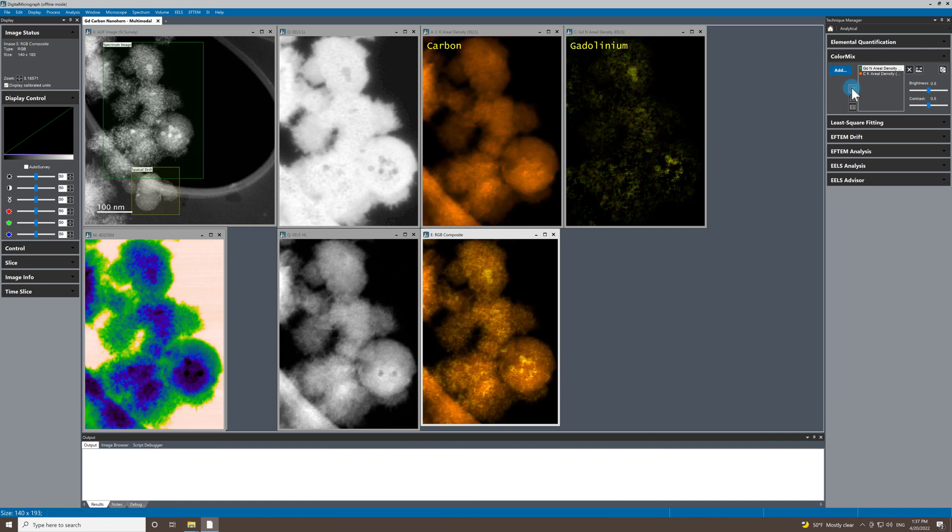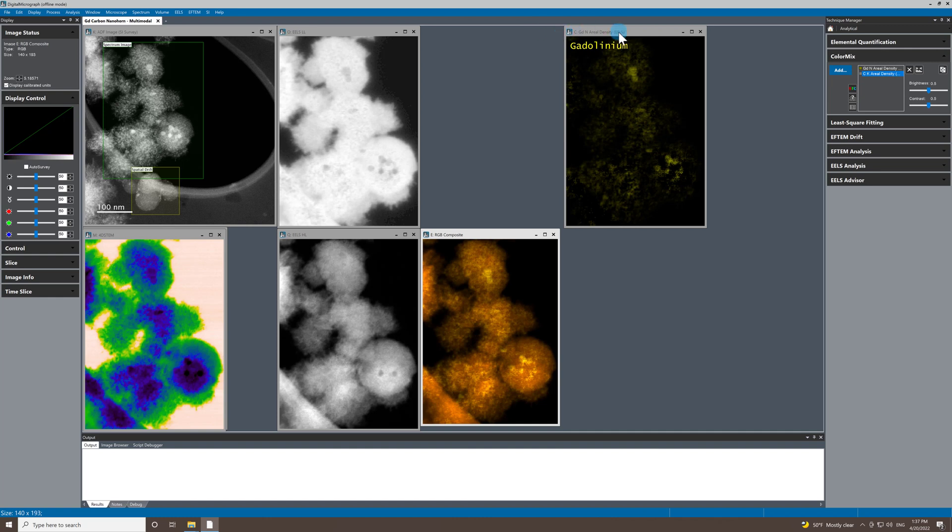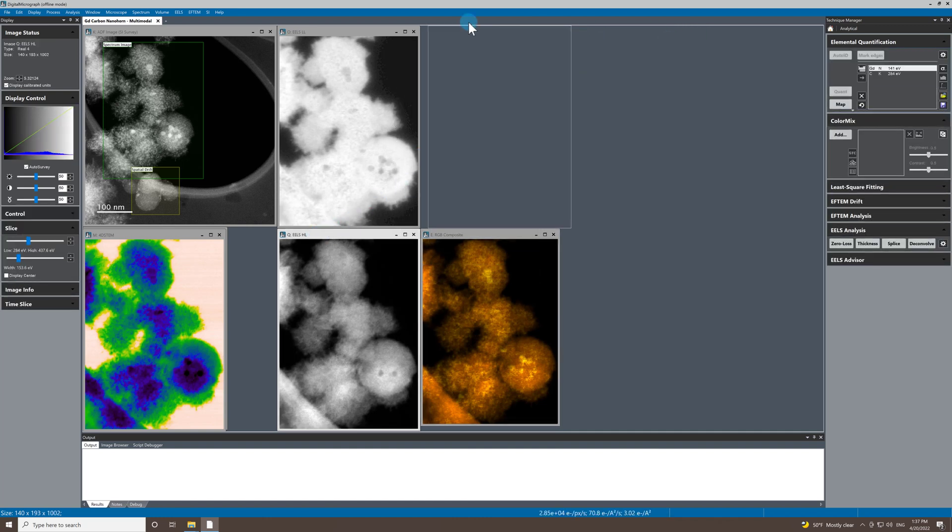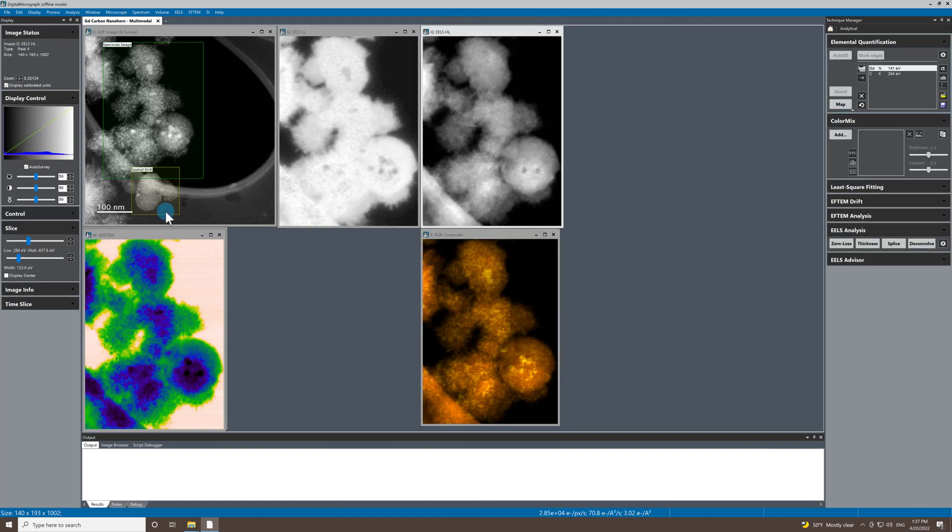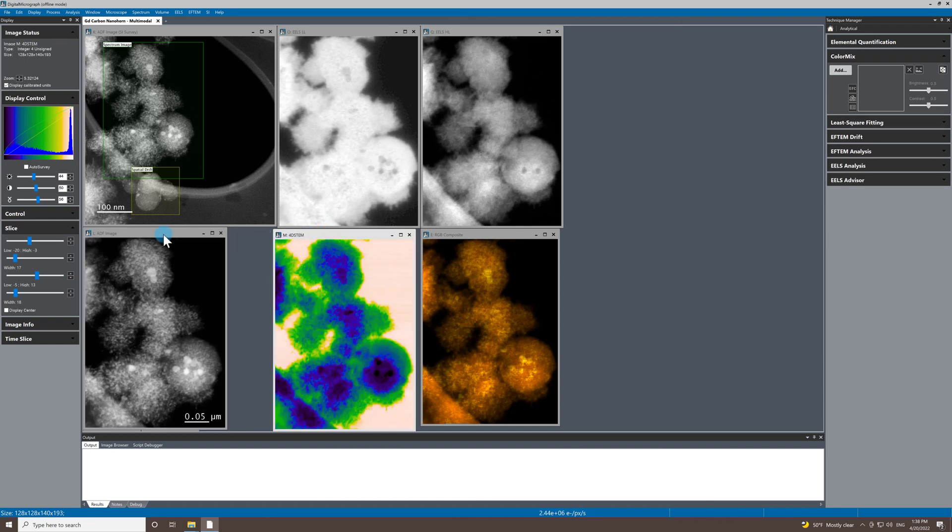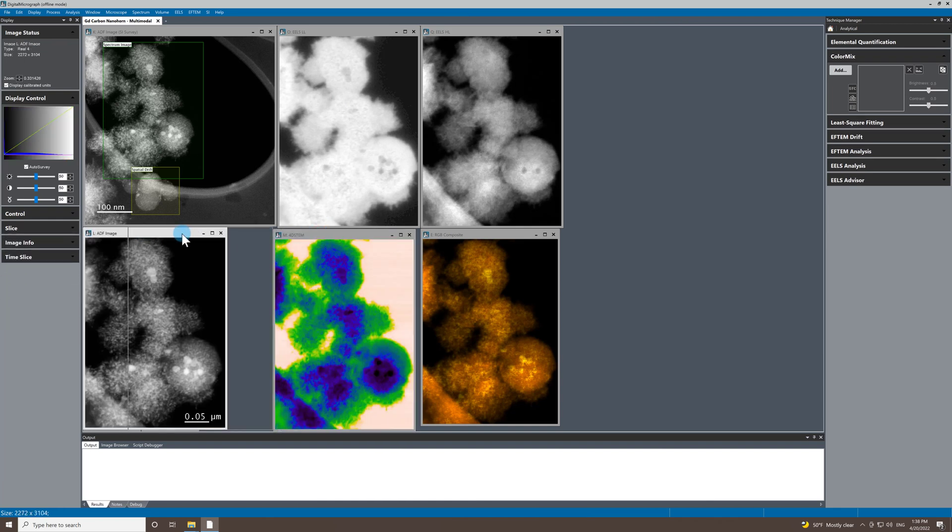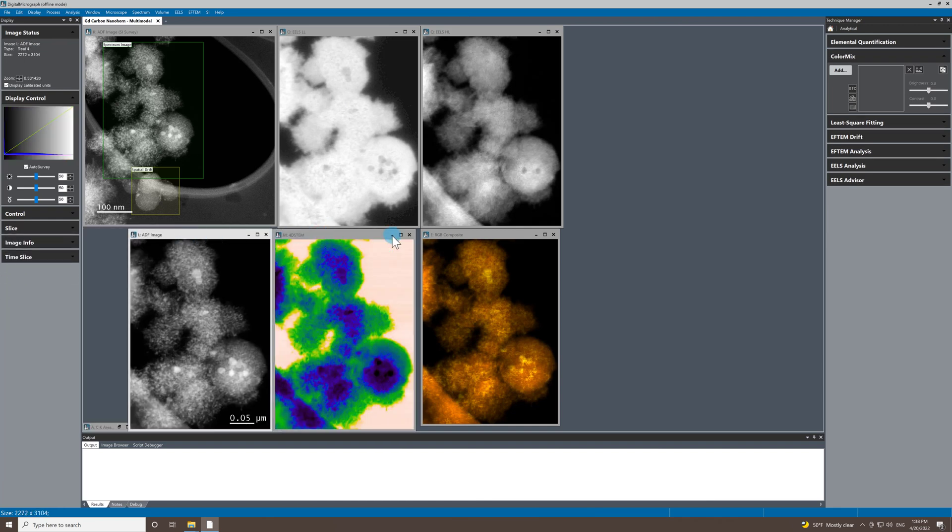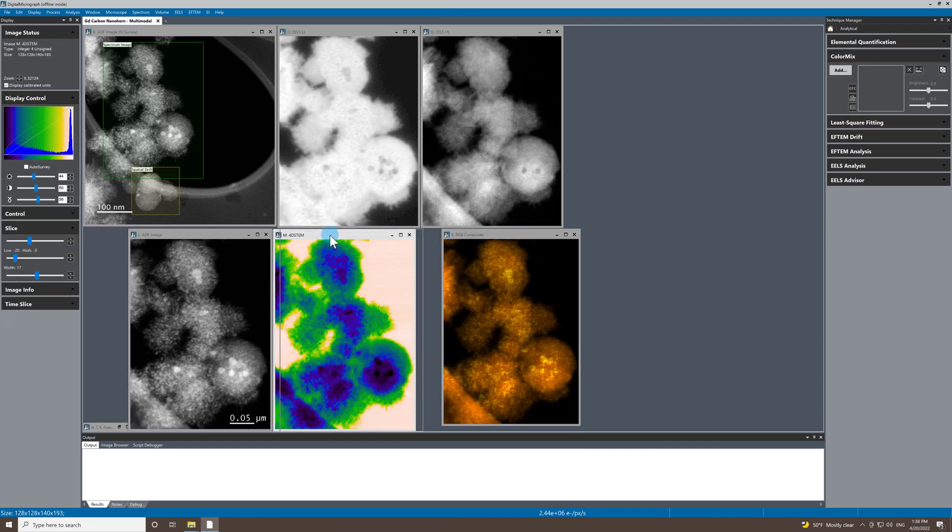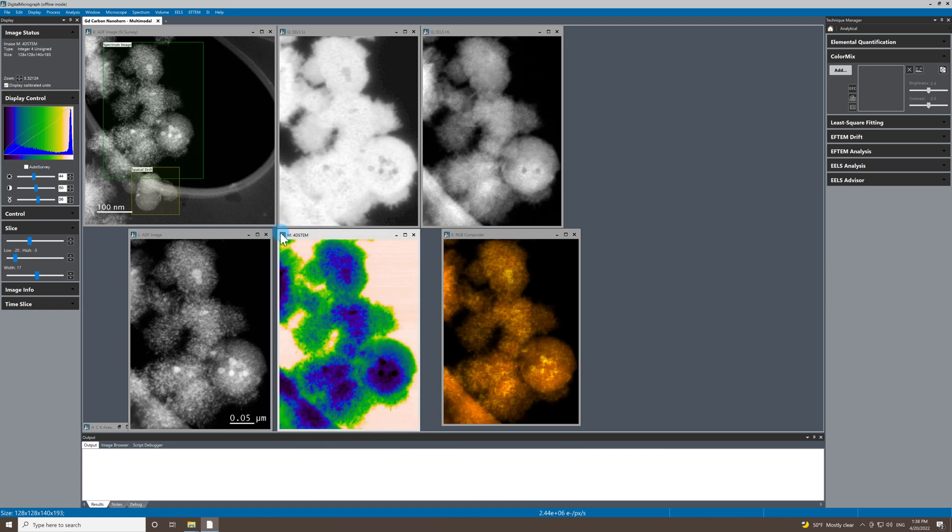I don't really need these separate maps anymore, so I'm going to minimize those. Let's tidy up a little bit, put my high loss up there. We've got ADF down here and then just move our 4D STEM to there.